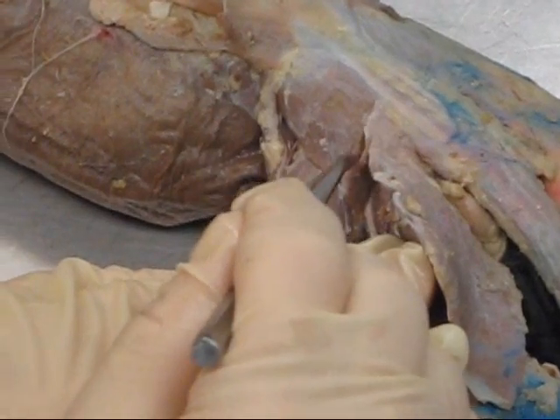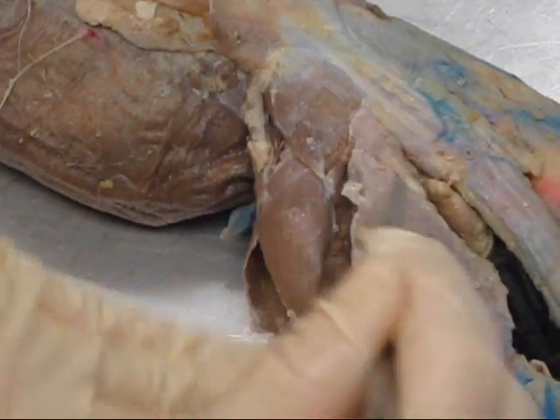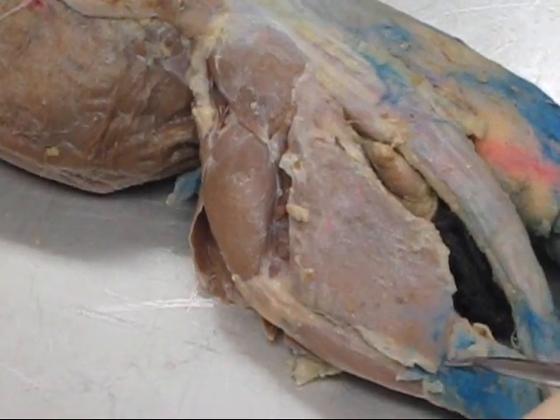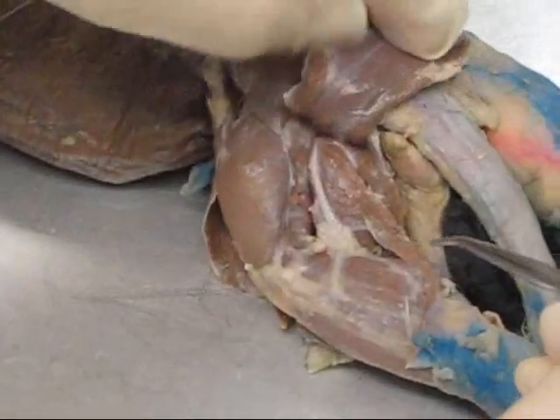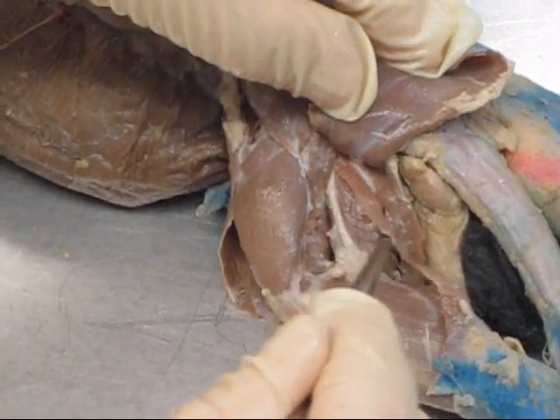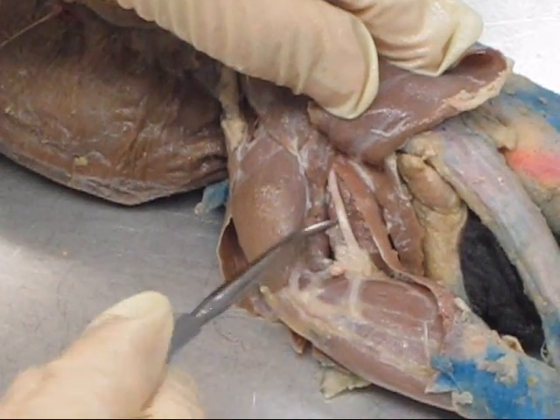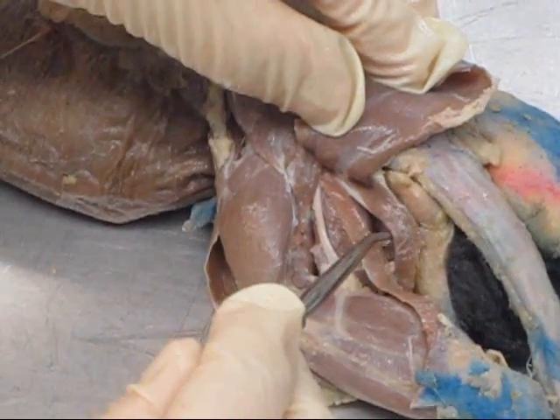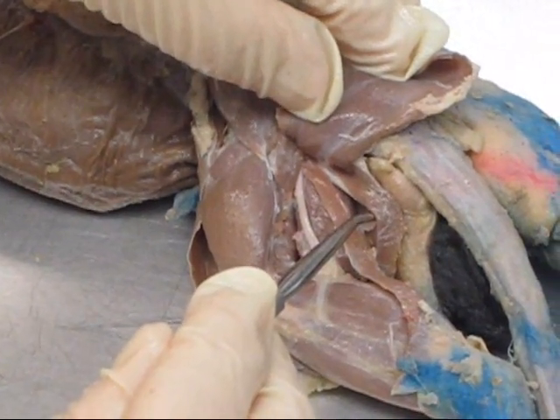Right in here we had caudofemoralis. This is biceps femoris — reflected biceps femoris back like this. We saw tenuismus. Then, remember our landmark sciatic nerve sitting right on top of the semimembranosus. Then, by the tail, the semi-tendinosus.